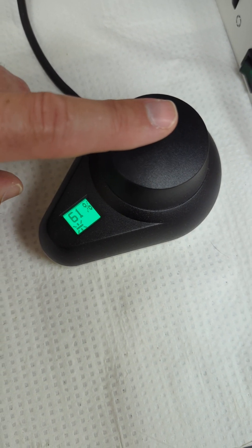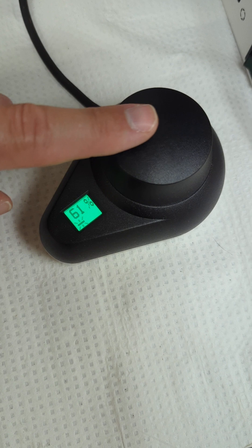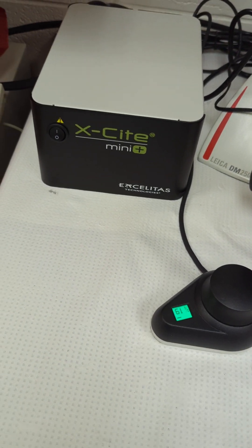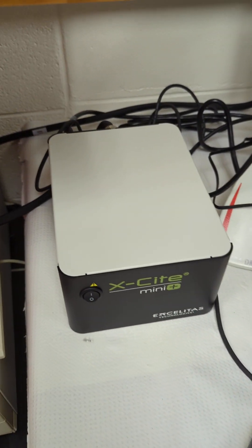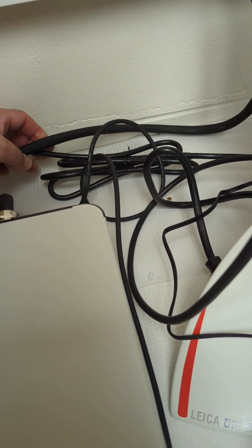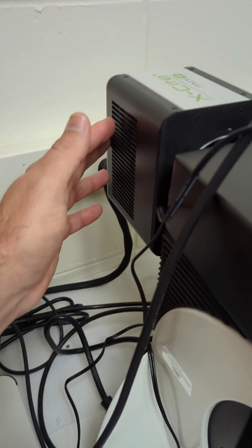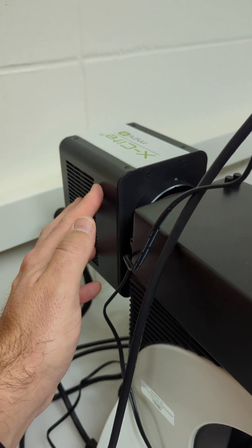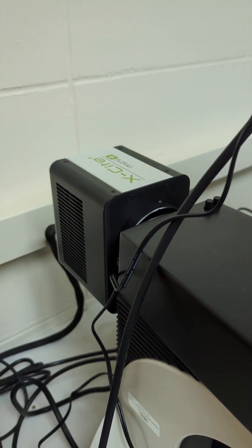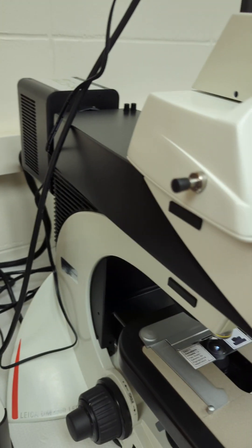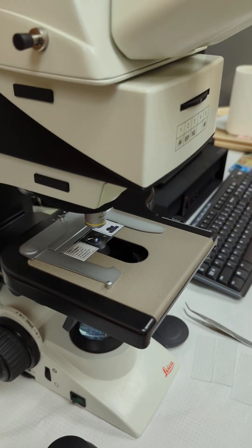That's the Excelitas X-Cite mini plus, and it's got a giant cable back here that goes up and powers the actual lamp inside this box here that's attached to the back of the scope.